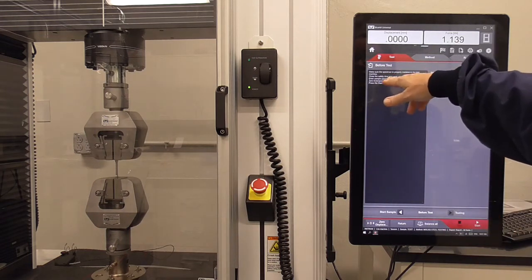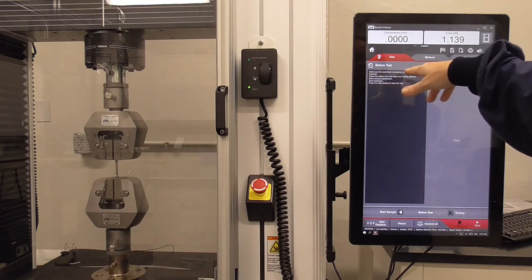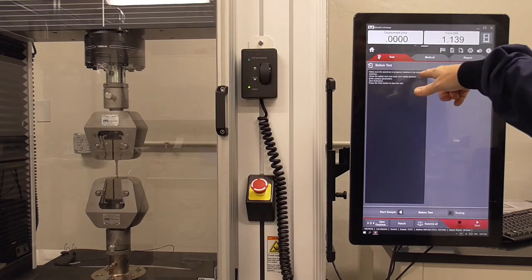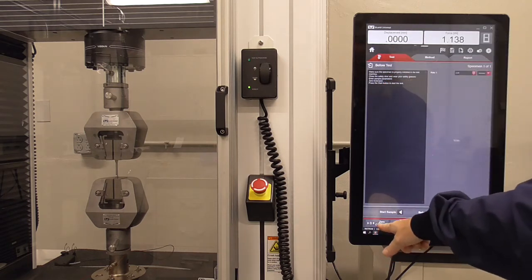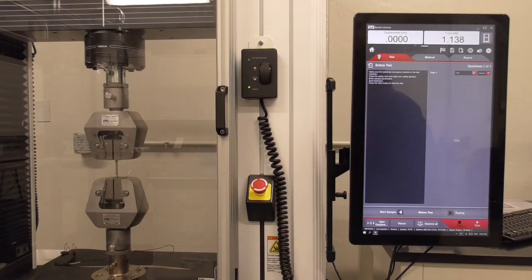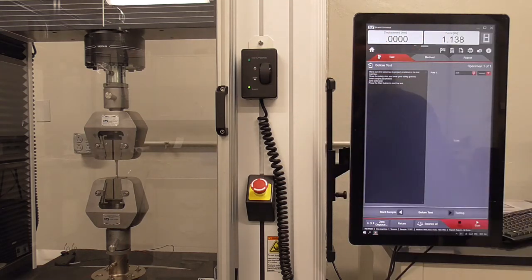Before the test, there are a bunch of reminders: make sure your specimen is properly installed, close the safety door, wear your safety glasses, enter your sample's parameters, and zero the extension. Once everything is ready and the extension is zeroed, you can hit the start button.